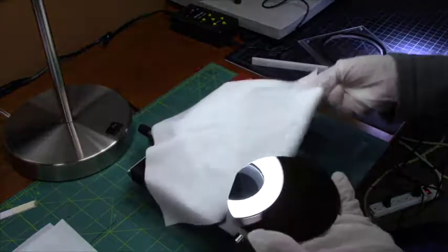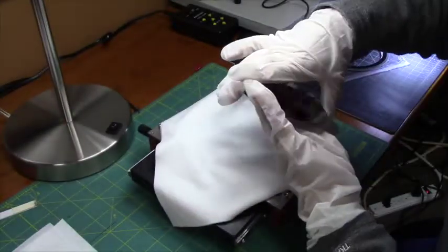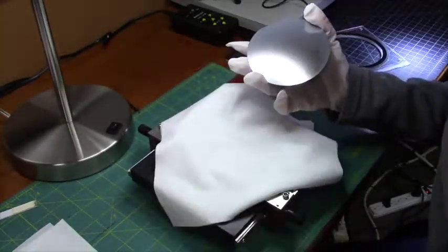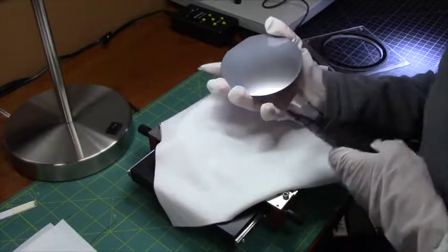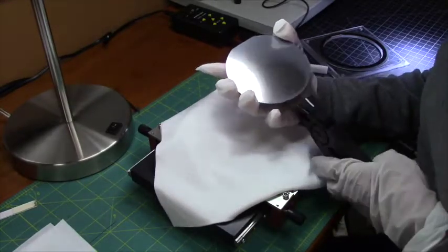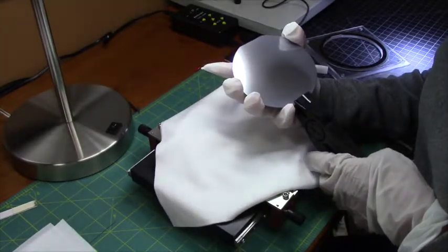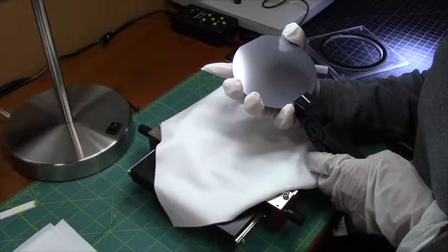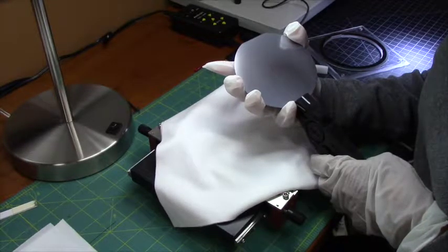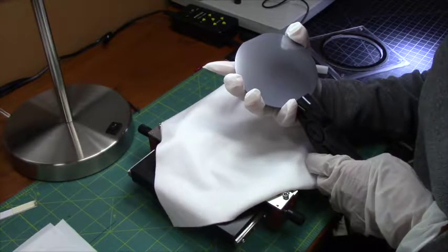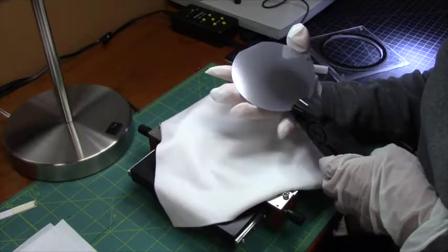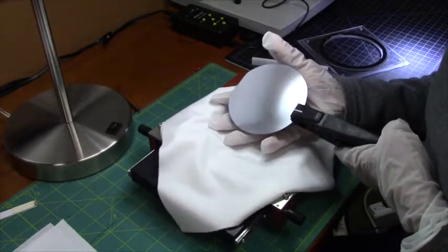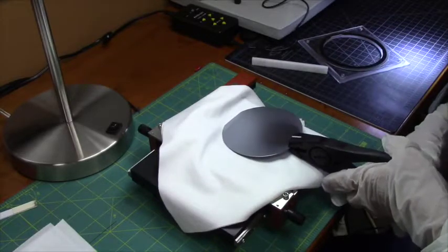I am going to put clean room cloth here. And I am now going to use my pliers to cleave the sample. And I am just going to squeeze gently to cleave the wafer.